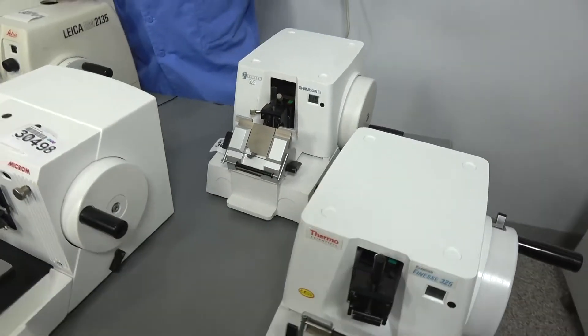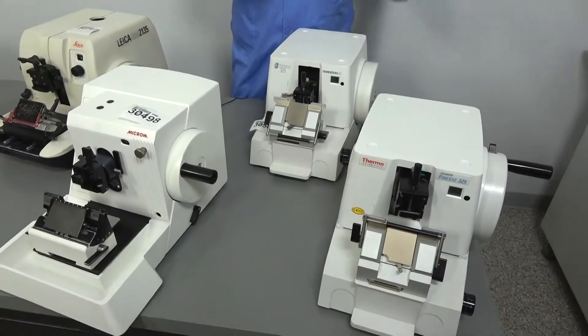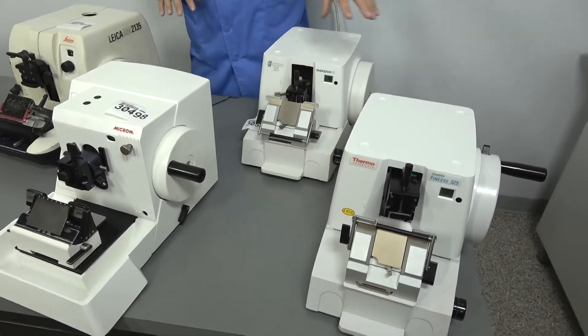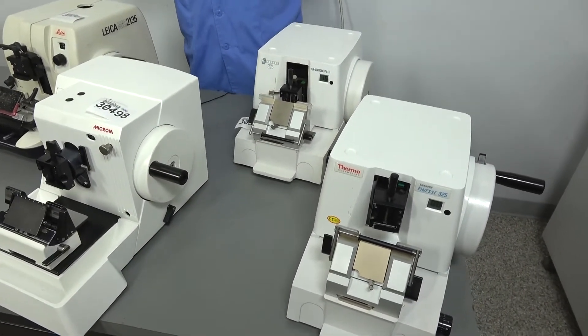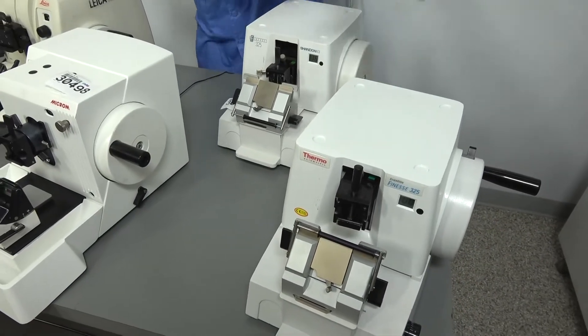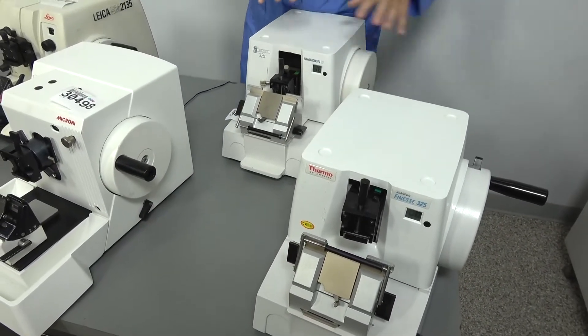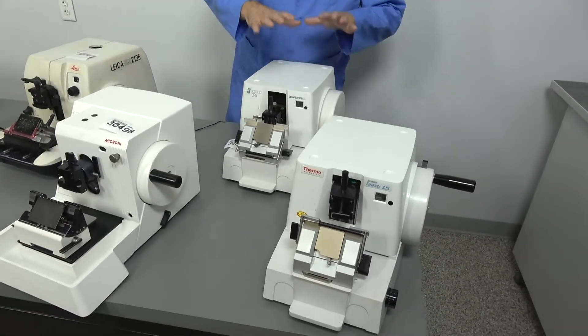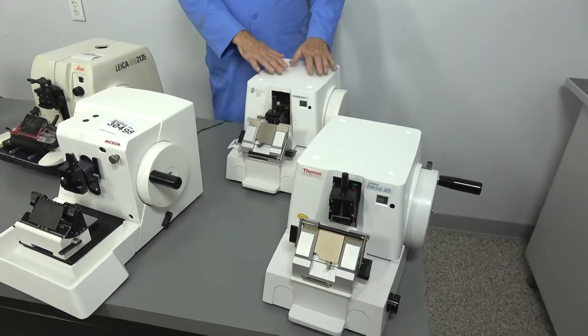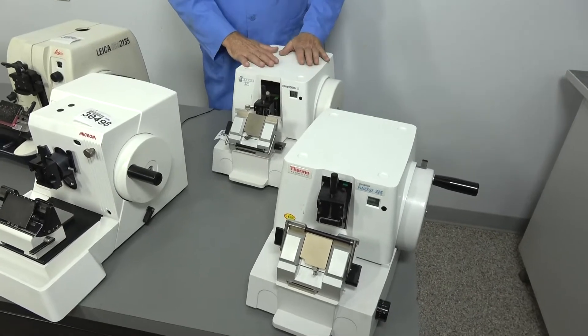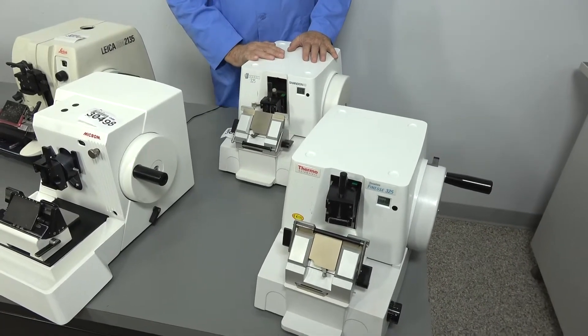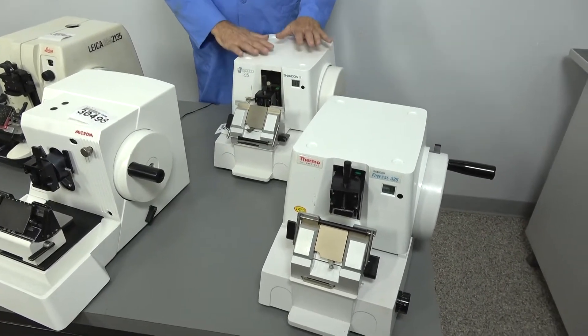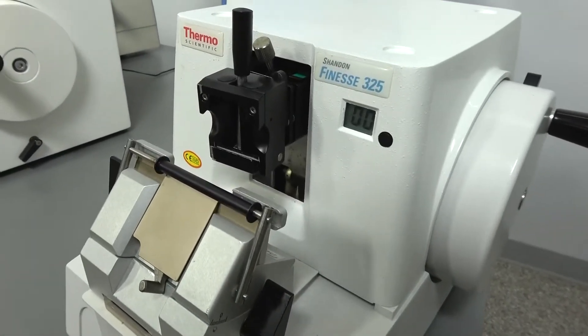They have a very different design than the other units and appear to be one of the longer life units, made for a longer period of time. These are both Finesse 325s, yet there's considerable age difference to them. Also, if you're planning to keep your machine a long time, these are a good model to consider because they are easy to lubricate, oil, and do maintenance on.